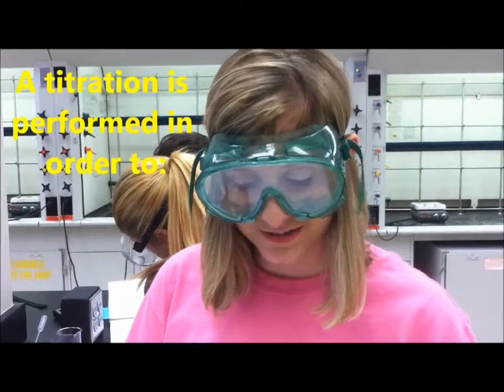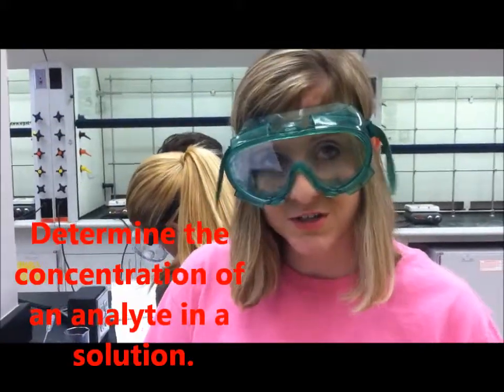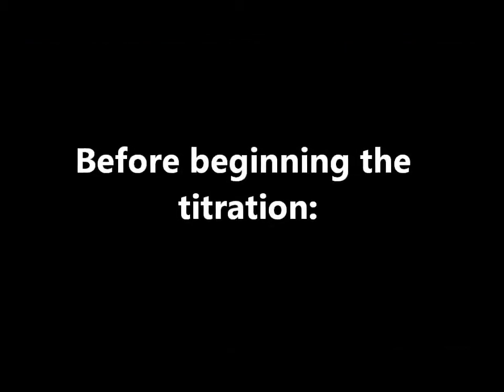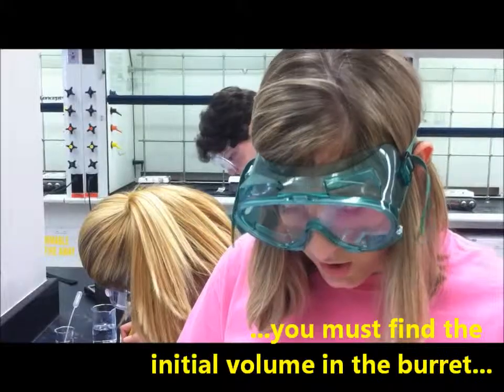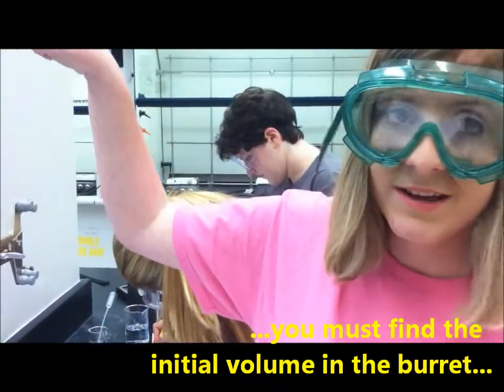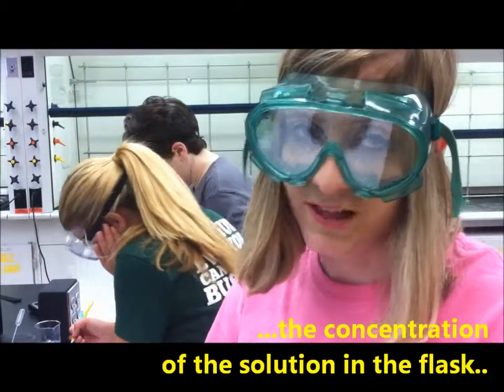Today we're doing titrations, and a titration is performed in order to determine the concentration of an analyte in a solution. You need to know the initial volume in your burette, the concentration of your solution that is in your flask.